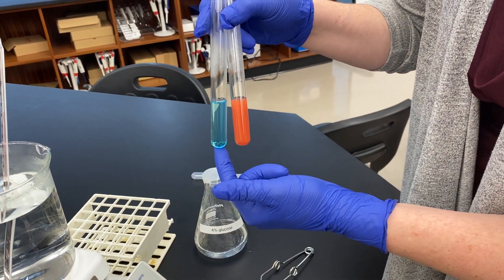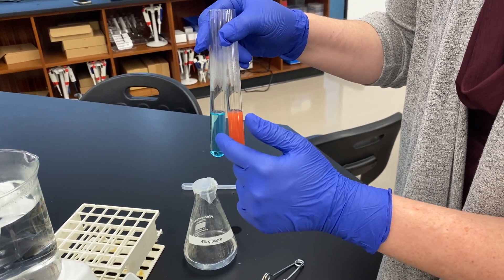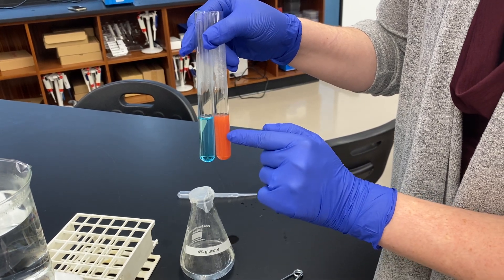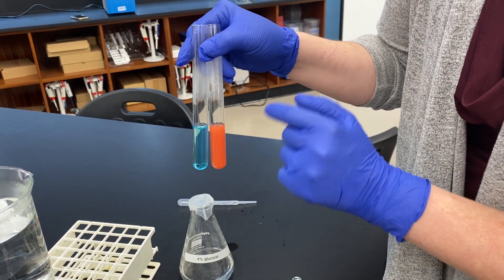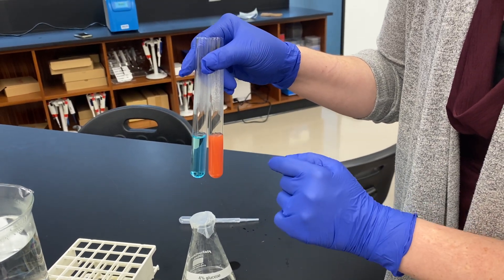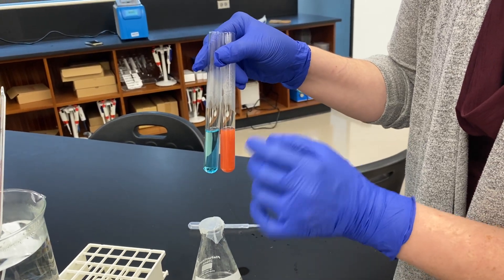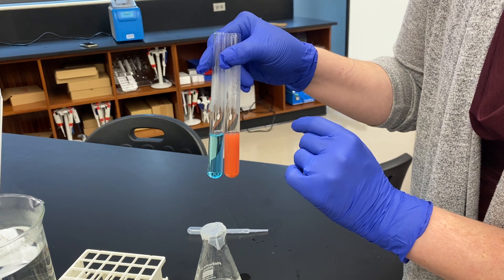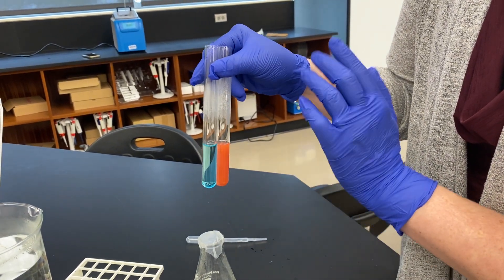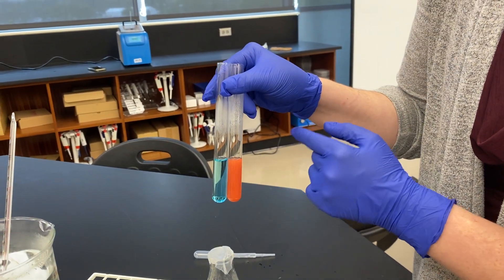Your negative control has no visible reaction — no visible reaction means it stays blue. The positive reaction should change color, and any color change is indicative of a reaction. The amount of color change will dictate how much reducing sugar is present. So even if it turns a little bit green, that means there's a reducing sugar. In this case, the positive control shows the highest amount of sugar possible with that bright orange-red color change.